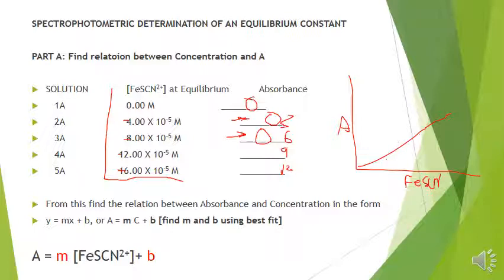So when you do that, you put in X, this column, and in the Y, you put this column, and then you'll end up getting an equation that says Y equals Mx plus B. They'll give you a value for M and a value for B, and hopefully you guys know what those mean. M is slope, B is the y-intercept. So what I would really like is for you to have this equation and write it down. Make sure you write that down in the report.